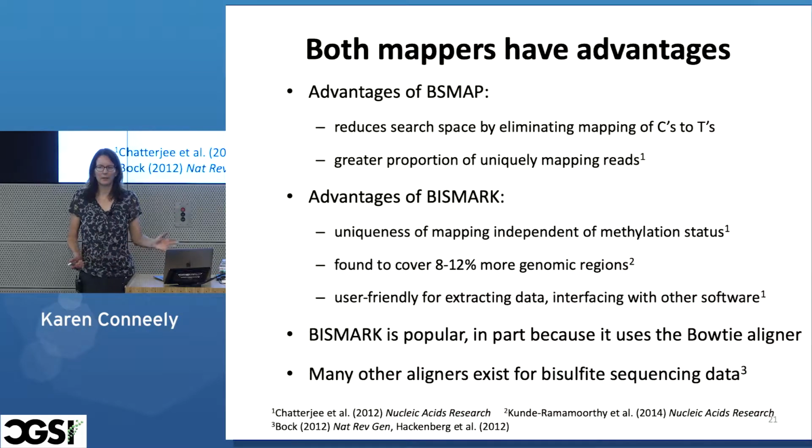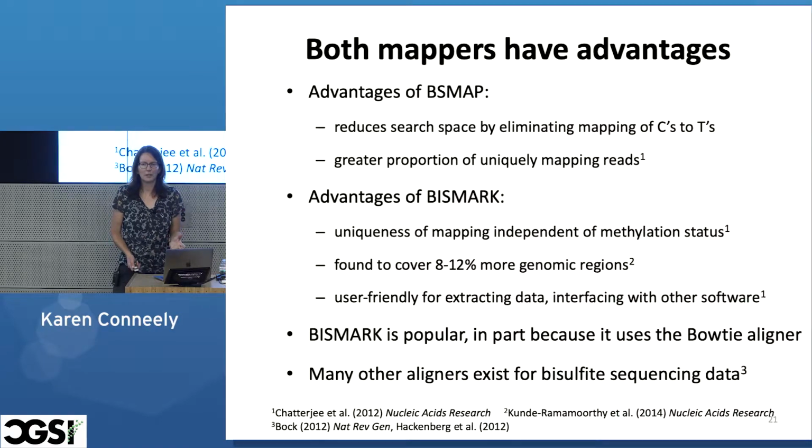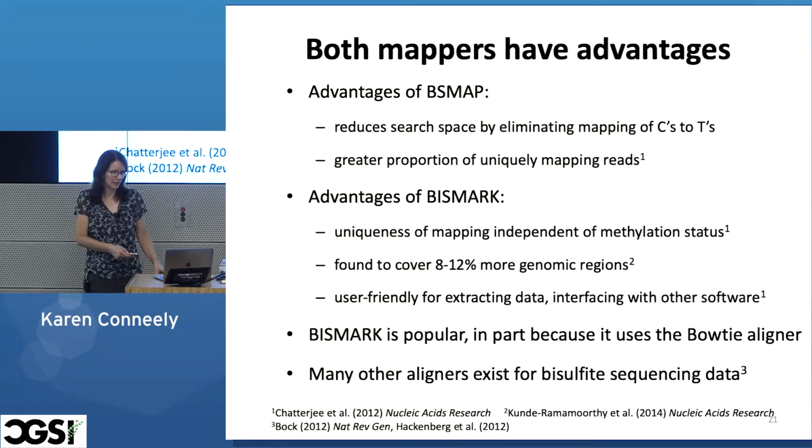And I think this is in part because it's based on the bowtie aligner, which everybody uses. And in addition to these two, there are many other sequence aligners available for this kind of data. And I've cited a review at the bottom here.